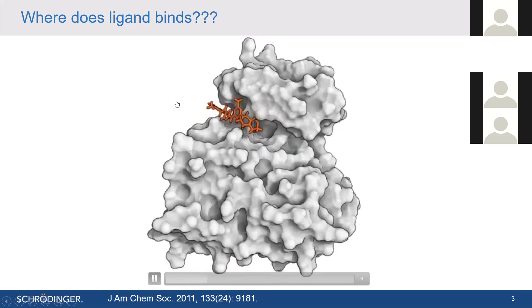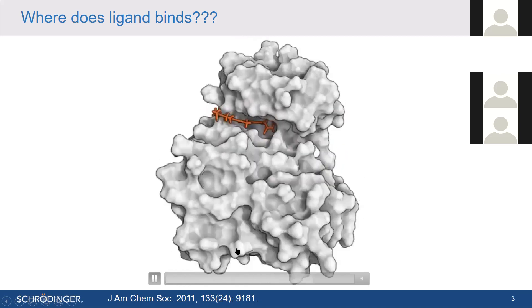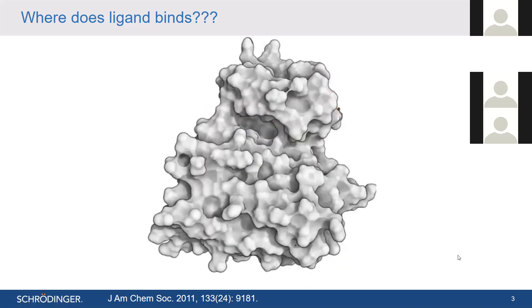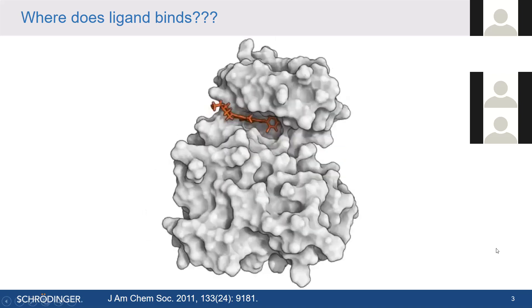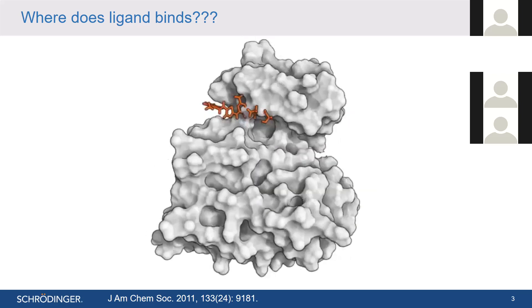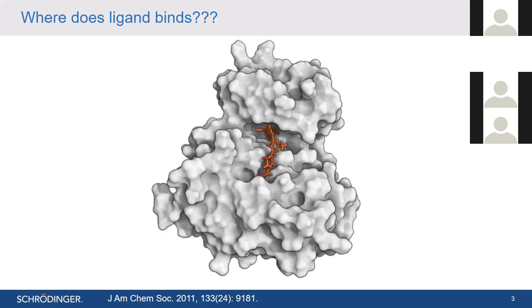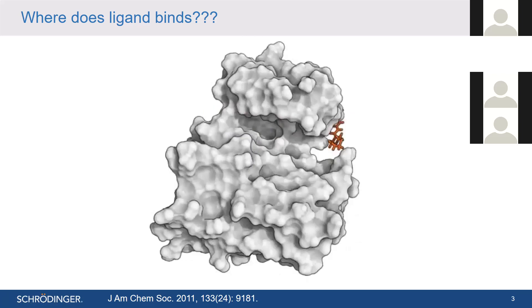The whole protein has a very uneven surface and is not at all static — surfaces change with respect to time, forming various small and large binding cavities. During the simulation, the drug tries to explore various small and possible pockets inside the protein, and finally it fits into a particular pocket where it is stable enough. This pocket we call the binding pocket — the specific pocket inside a protein where a drug or inhibitor can bind.